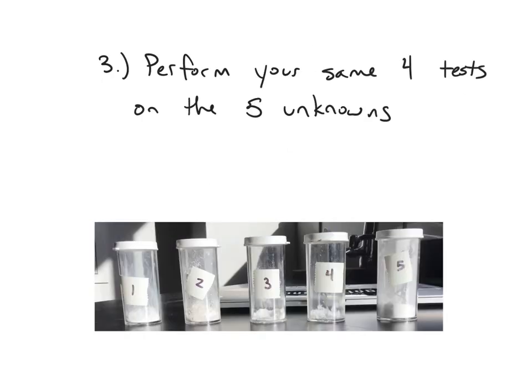Next, you're going to perform the same 4 experiments, or the same 4 tests, that you did for your knowns on your 5 unknowns. Down below, there is shown in the picture as numbered 1, 2, 3, 4, and 5. You may have 6, 7, 8, 9, and 10, or you might have 11, 12, 13, 14, or 15. Now, some of these unknowns would match the identity of your knowns, but not all of them. Obviously, you only have 6 knowns and there are 15 unknowns, so there's going to be some ones that aren't matching. The whole job is not to actually identify the actual substance, but just simply identify the type of bond that the unknowns are made up of.